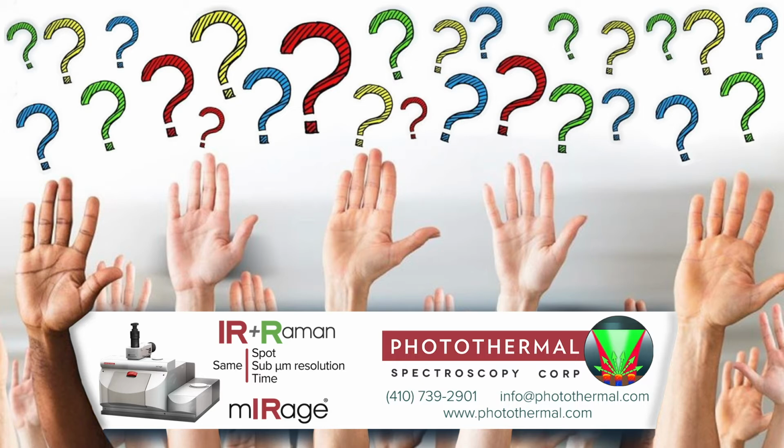Yeah, because if you can go that side, then there are fluorescence issues there. Yeah, I mean, it might be something that I don't know whether you... That question reminded me of something that I heard somebody suggest, and you know how for Raman you can do visibly resonance enhanced Raman just by tuning the excitation to a particular visible excitation. You can do the same with vibrational as well. It would be an interesting experiment.